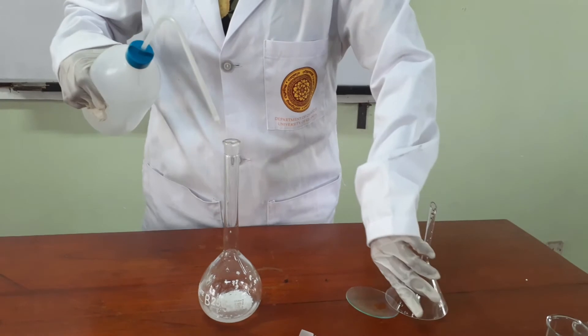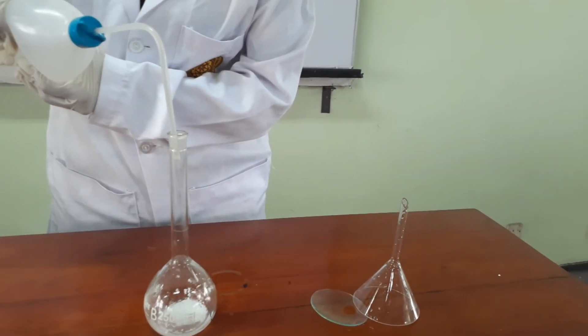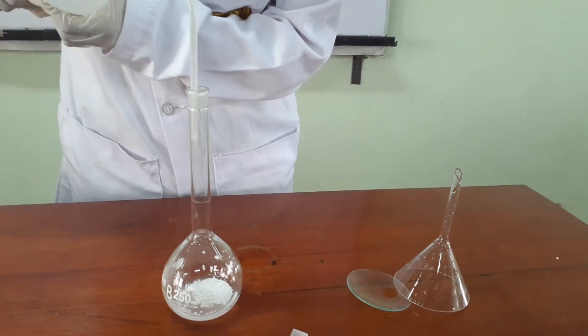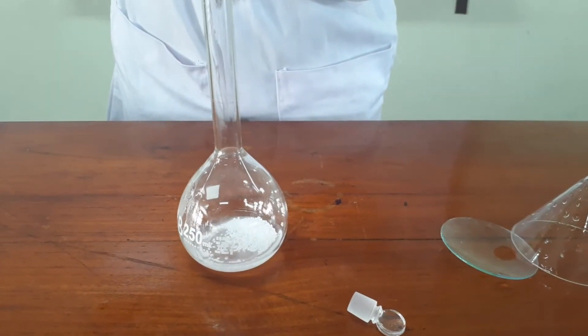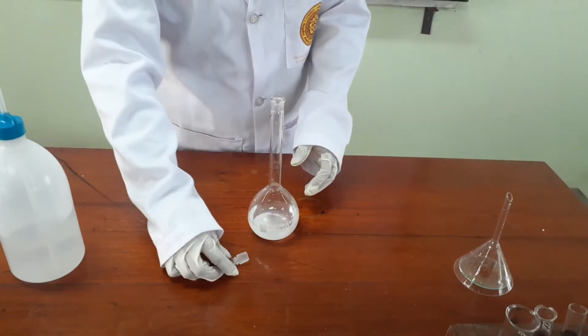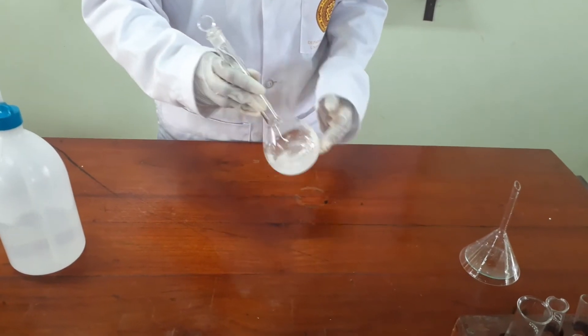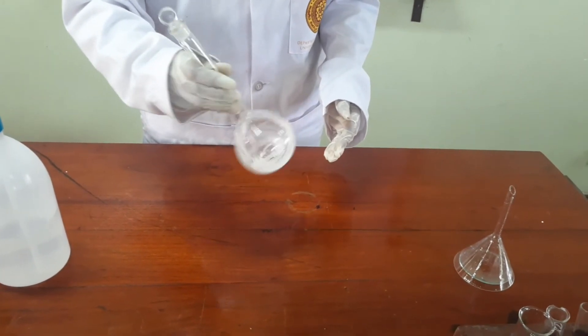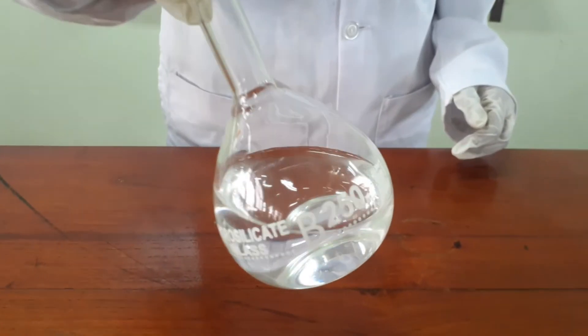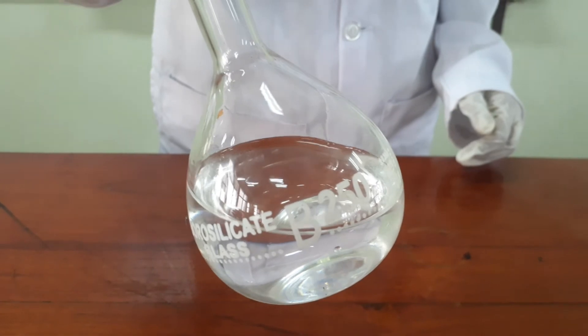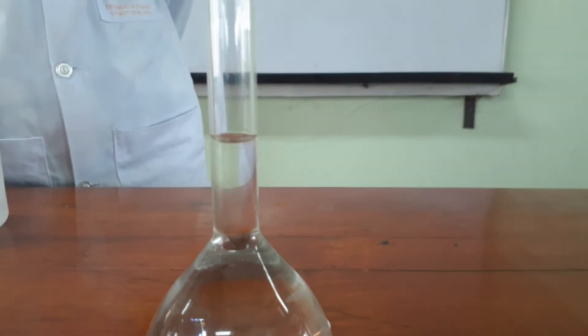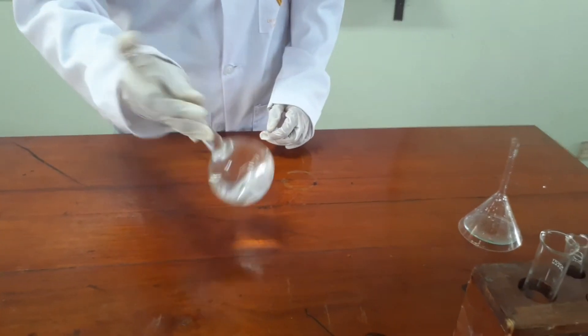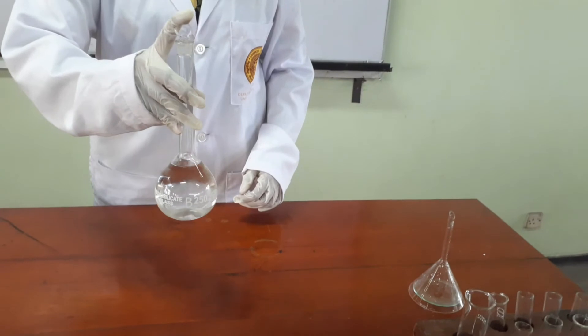After washing the funnel, remove it from the volumetric flask. Then add some amount of distilled water to the volumetric flask. Then add distilled water carefully up to the mark. Then stopper the flask and invert upside down in order to mix the whole solution evenly.